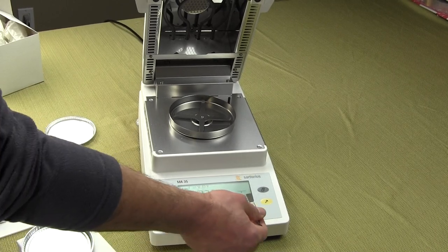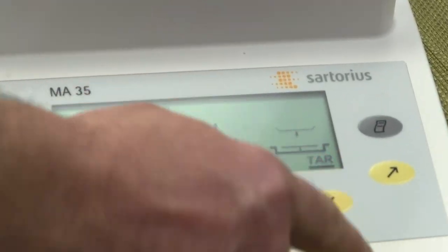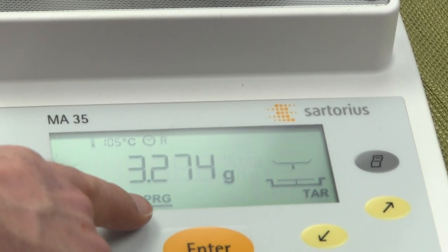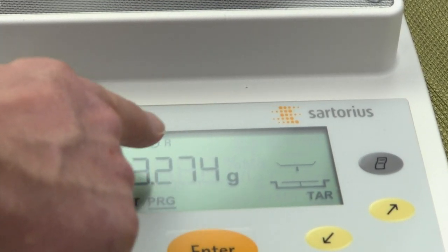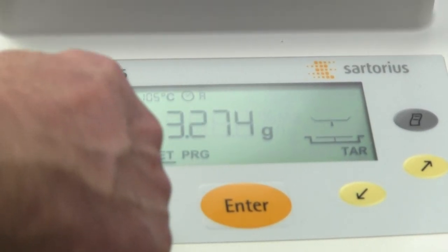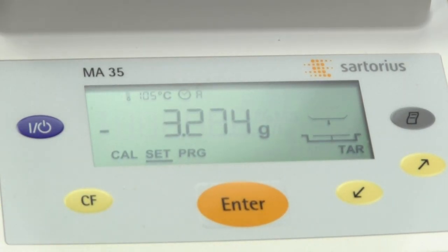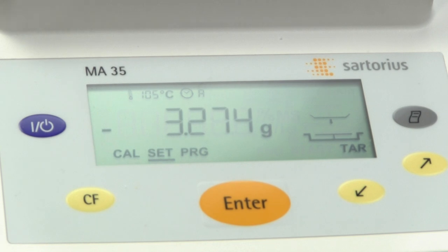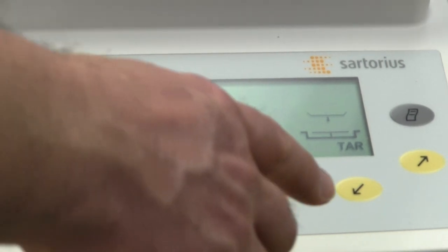On the lower part of the display are all the functions. Tear is highlighted — if you press the left arrow you move into program mode, where you can control the temperature and duration and whether it's in manual or auto mode. You also have a set function where you can store the parameters. The MA35 has one memory location — for example, you could store a setting of 145°C for 13 minutes.